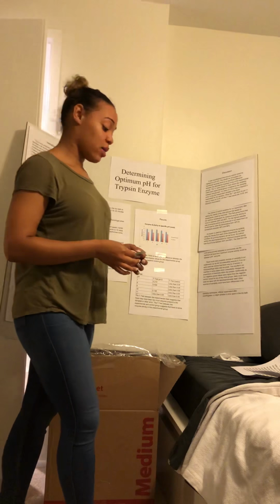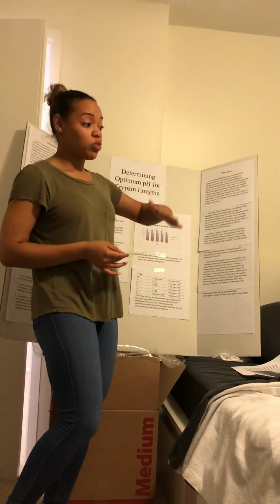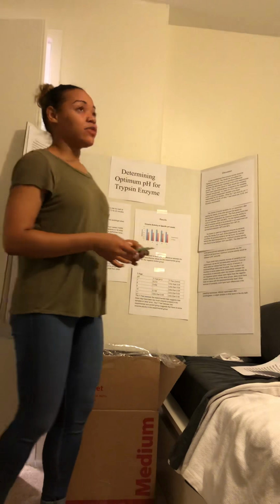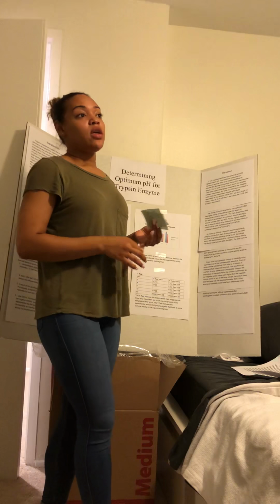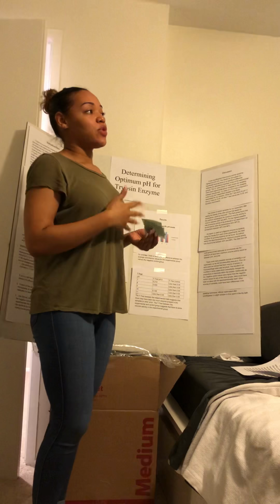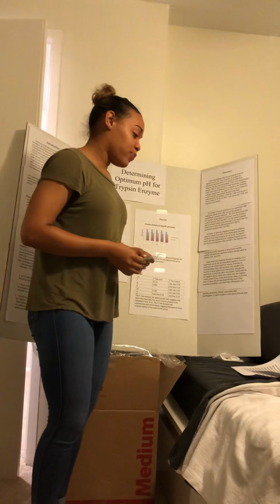The pellet that we found in each centrifuge tube was the uncatalyzed particles in the reaction, and what was in the supernatant was actually going to be the catalyzed parts of the reaction. The point of reading the absorbance was, if there was a higher absorbance, there's more catalyzed particles in the supernatant, so therefore there's more enzyme activity going on. So that's what we're trying to find out.